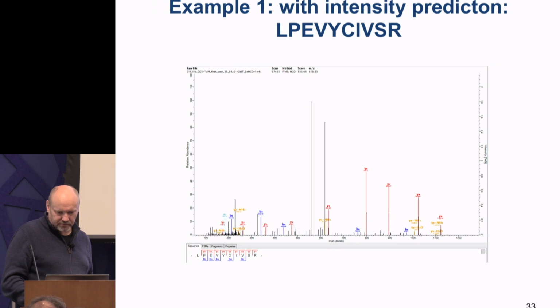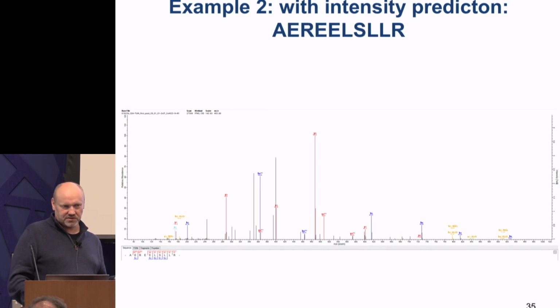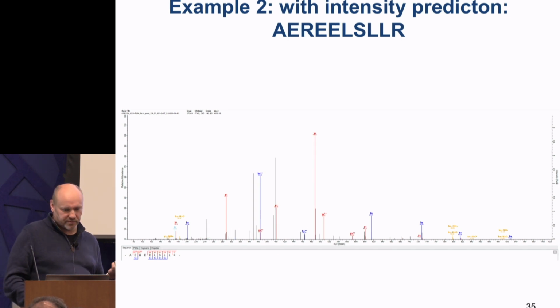So the EIVVI flip basically. But there are of course other examples where it's a completely different peptide, like in this case here. They don't have anything to do with each other, but it goes in the right direction. The new score is actually top scoring the correct version. And it's correct because it's synthetic peptides, so that's why we know it's correct.